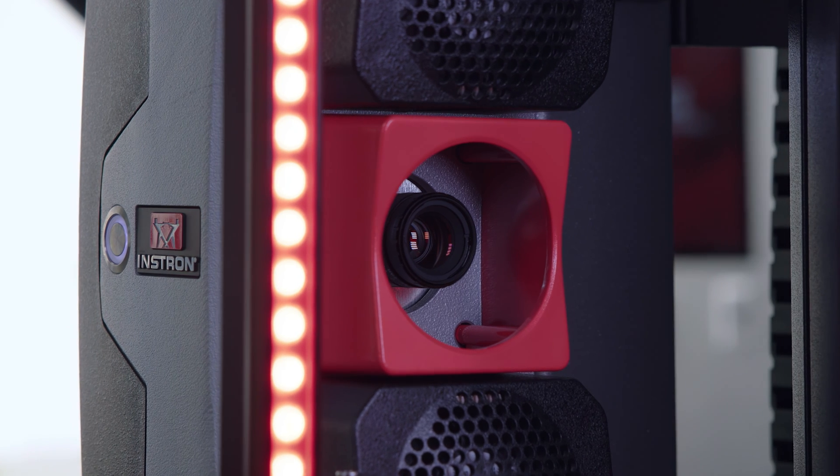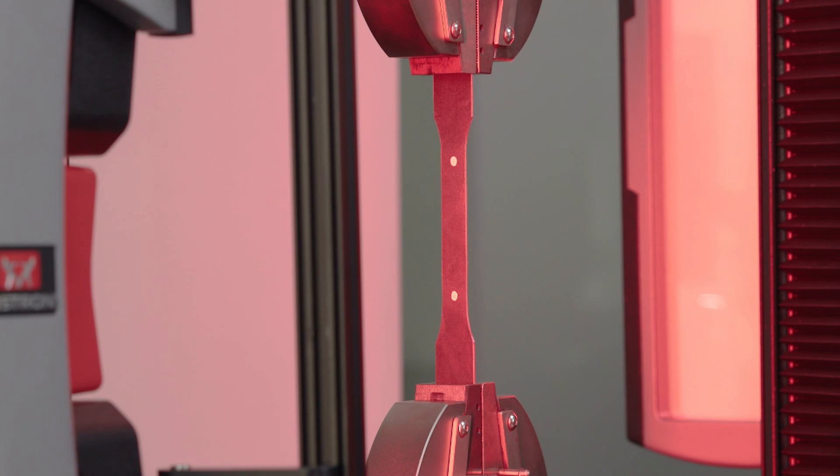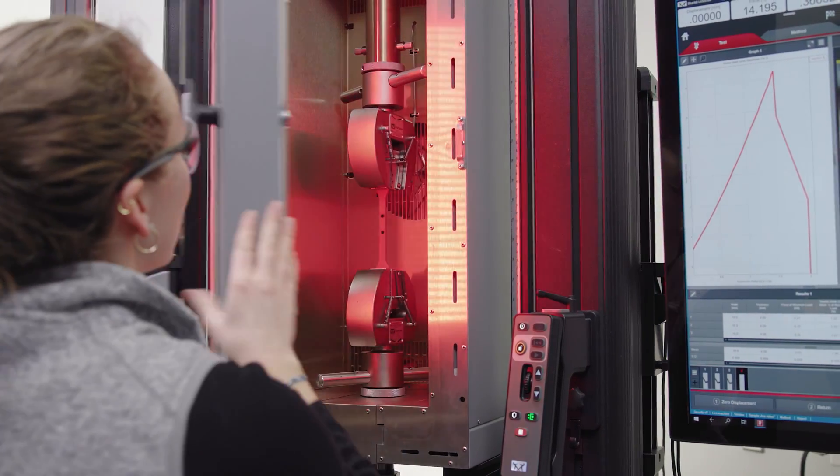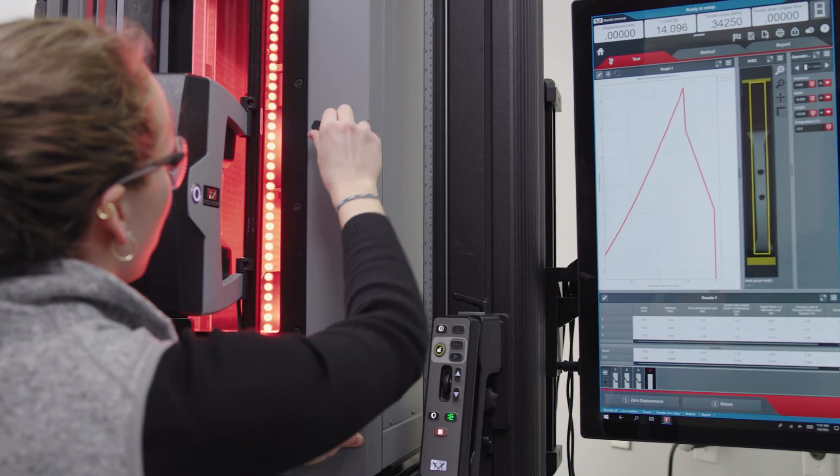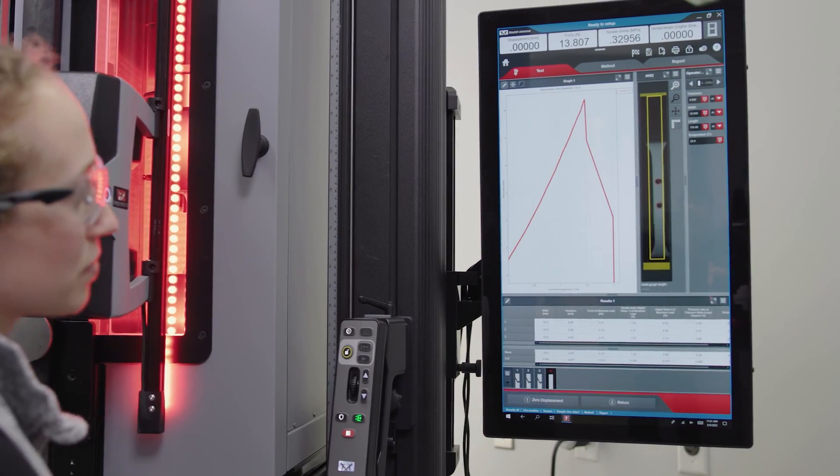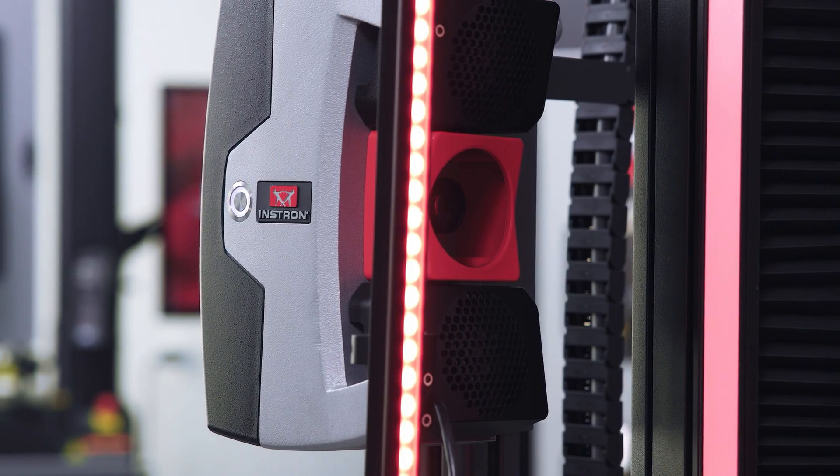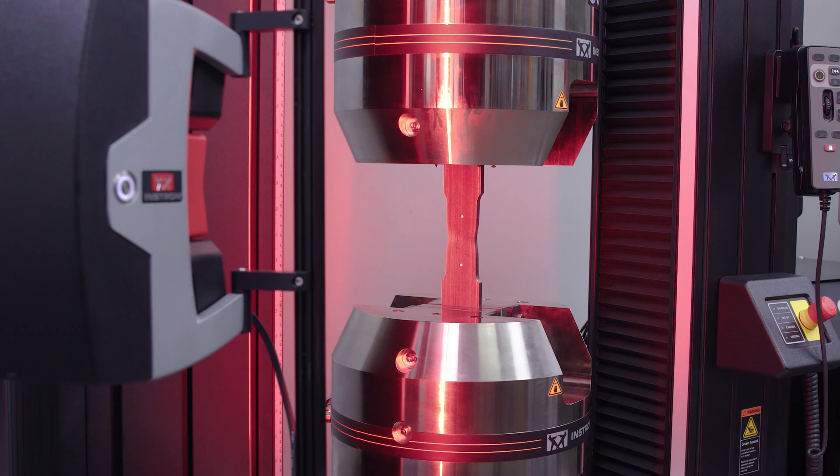Non-contacting extensometers measure strain optically without the need to touch the specimen or enter the test space and are also ideal for measuring strain on materials being tested at high or low temperatures inside a chamber. Video extensometers are considered the premium solution for strain measurement in the materials testing industry.